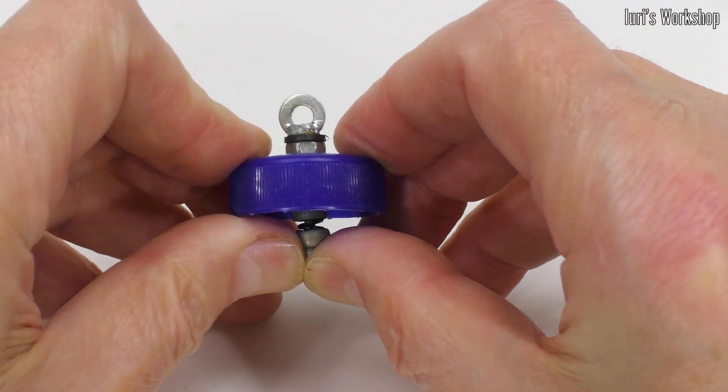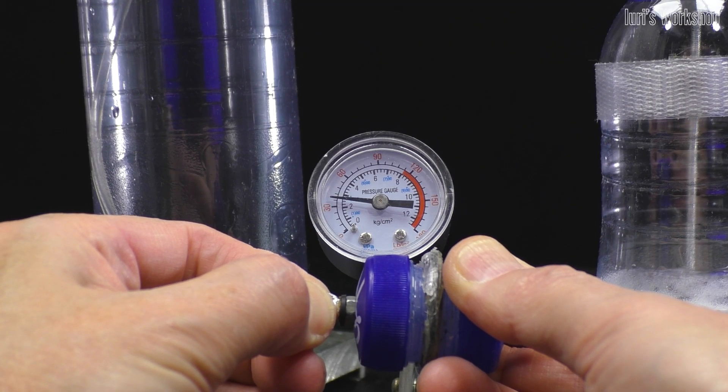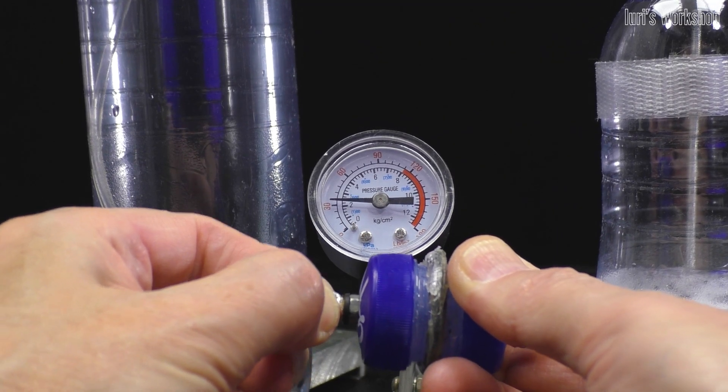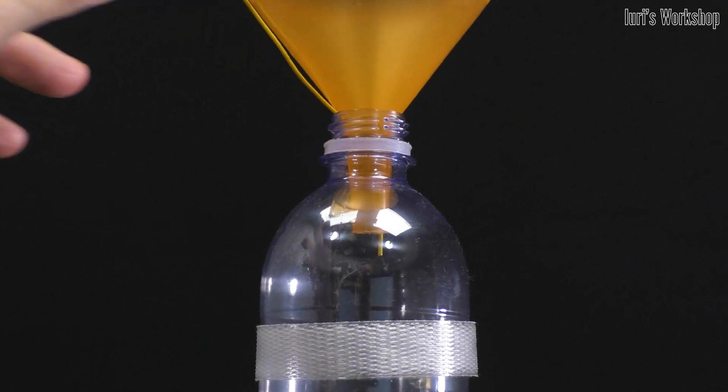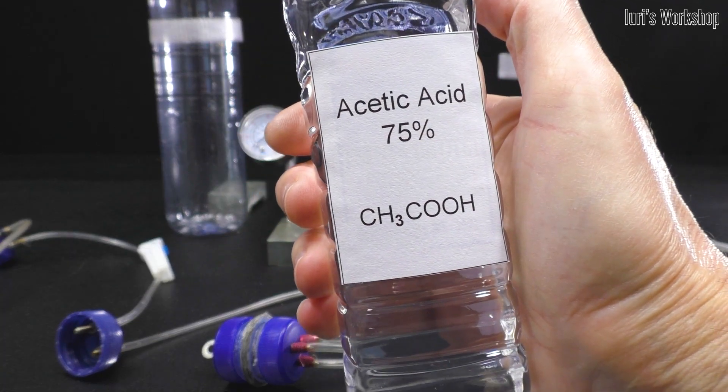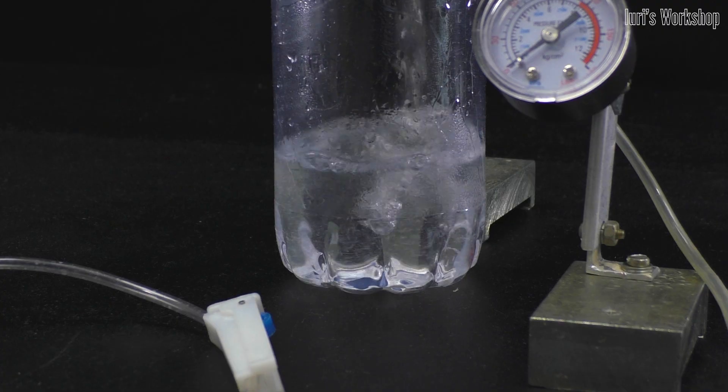And this safety valve protects the reactor from explosion in case of uncontrolled pressure increase. Let's test this reactor. First we'll pour vinegar essence into tank number 1.